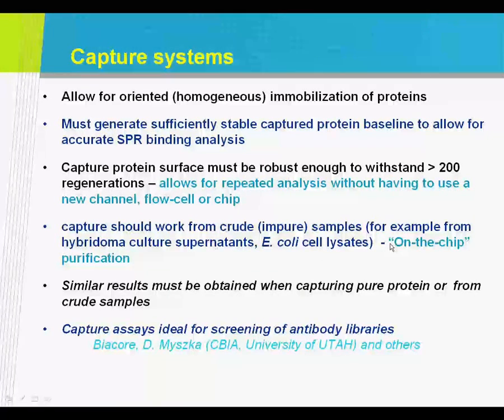And of course, when you capture, you really want to get the same results, the same data, same binding measurements, either when using pure protein or crude samples. And as I said, there are lots of papers out there that people have done it with monoclonals, and Biacore have published on it. David Myszka at the University of Utah has published quite a few papers on how to essentially analyze that data, and there are many other publications.